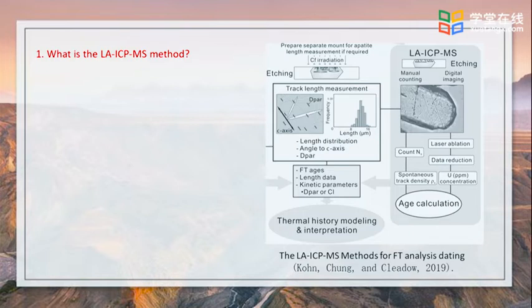This development has added a new approach for fission track analysis, whereby uranium-238 can be determined directly in mineral grains rather than by using uranium-235 induced fission tracks as a proxy, as required by the EDM.